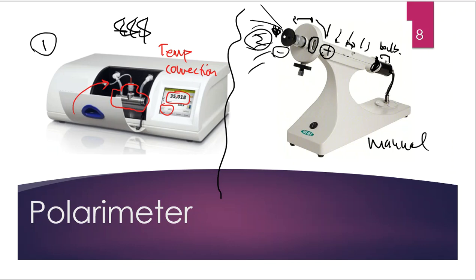Or number two, sometimes you've got an option to heat the sample compartment up to a specified temperature, and it will not measure until it heats that sample up to the temperature that you have keyed into the system. So depending on the kind of model that you have and the needs that you've got, temperature is going to be a thing that can change these values, maybe drastically if you're not very careful. Over here on the right-hand side with the more manual method, you really don't have that option. You have to record the temperature separately on your own. You've got to apply corrections and equations and math, and who wants to do all of that? Nobody. So here, automated systems really come into play much more.